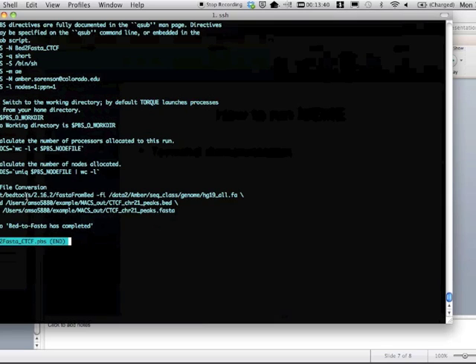So I use this program that's part of the bedtools package. It's called fastaFromBed. What's the nice thing about these bedtools packages? They are really obviously named. So this one is obviously, I want to make a FASTA from a bed file.